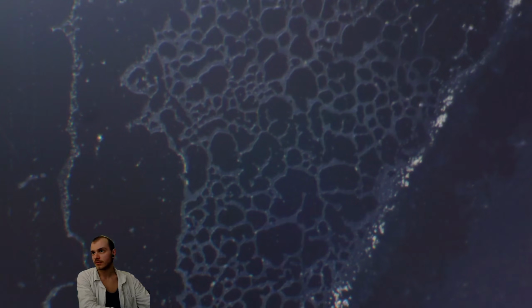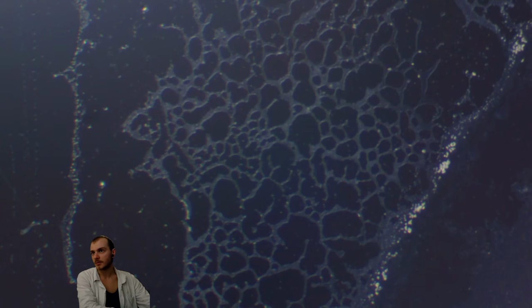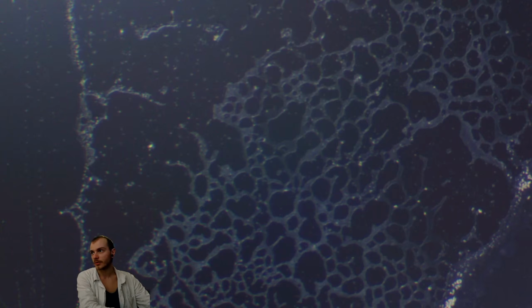This looks a little bit like slime mold, but it is some sort of creation in the water, probably by the bacteria.